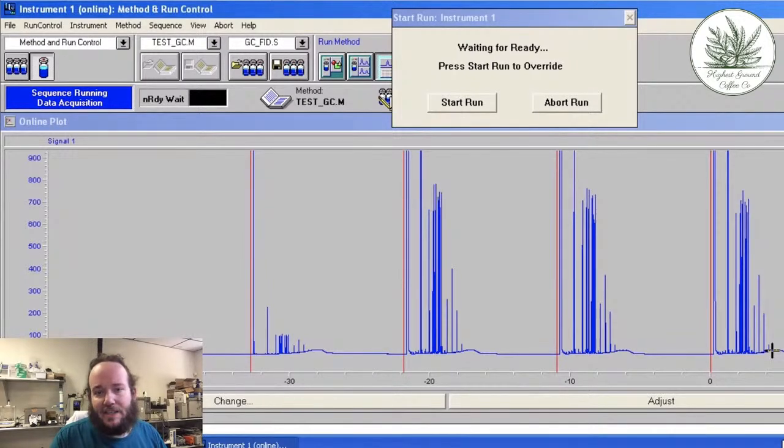The first test, it's just not valid. It's worthless. The next 2 after it, there's 4 here. So the first one's worthless. The second from the left, that's a good test. But these next two after it are not. They're not right, and it doesn't make sense as to why they're not right.